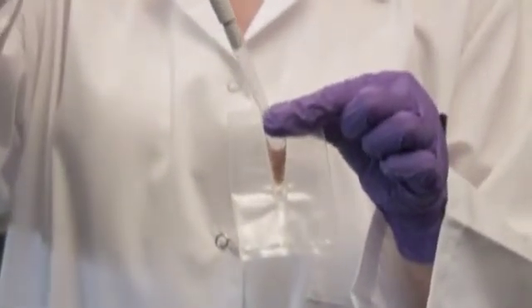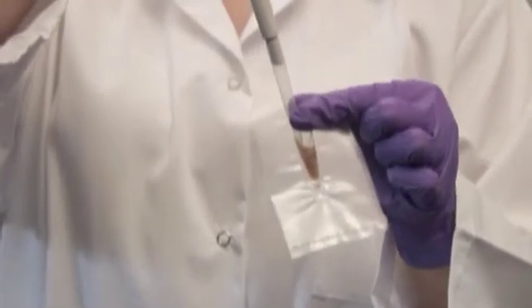The innovative shape of the Seward Microbag allows for diluent-free sample processing, a key advantage for clinical research.